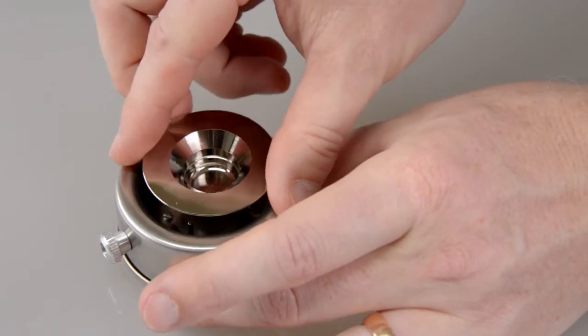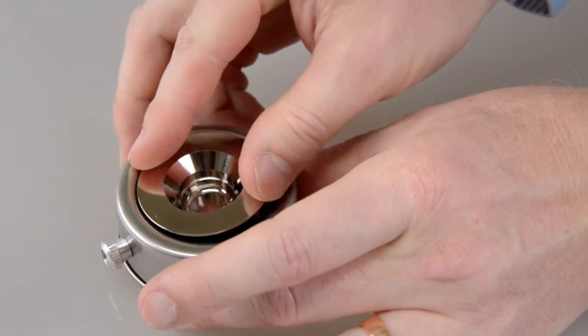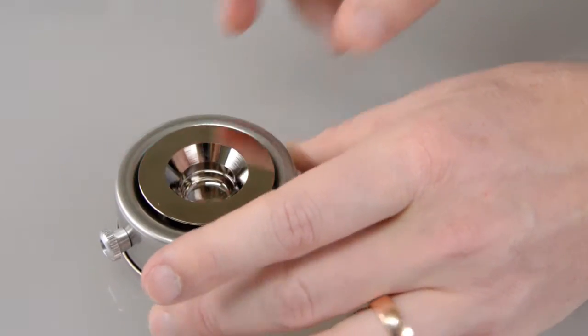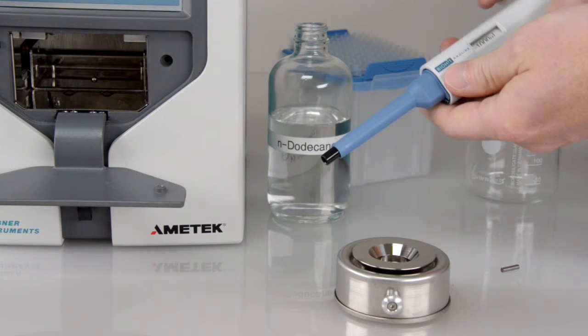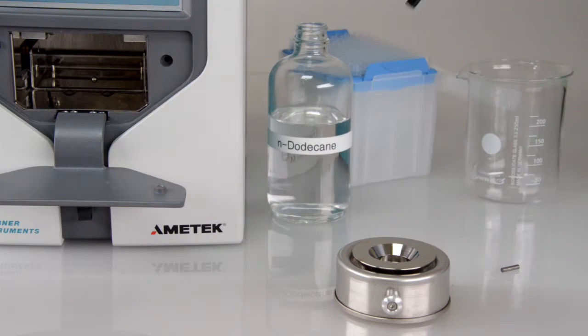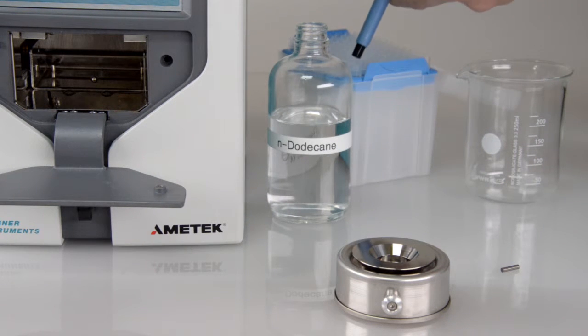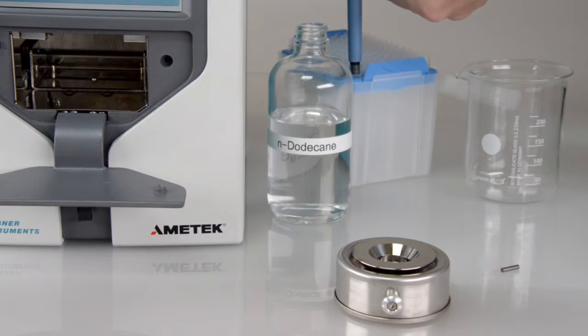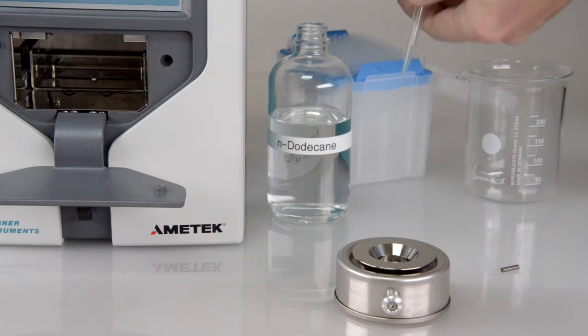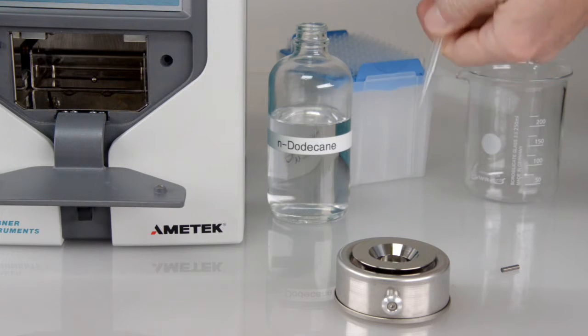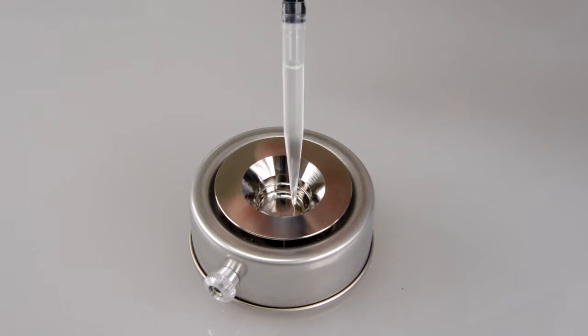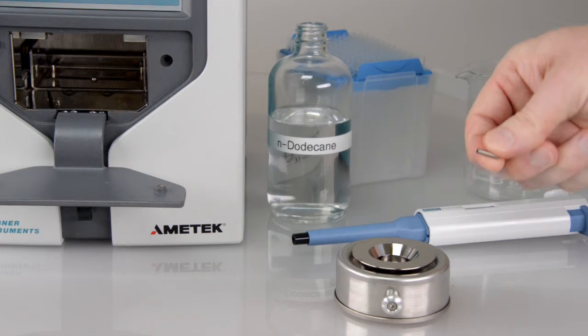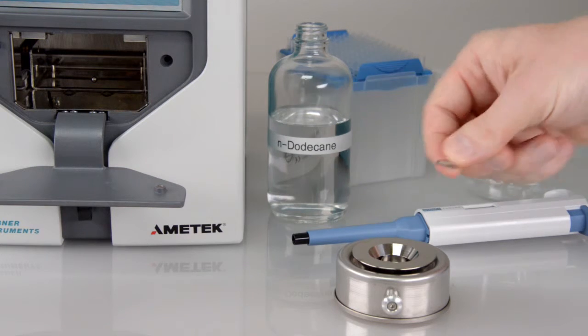Take the 1-milliliter sample cup and put it into the cup holder. Take the pipette, equip it with a pipette tip and fill 1-milliliter Dodecane into the sample cup. Insert the magnetic stirrer.